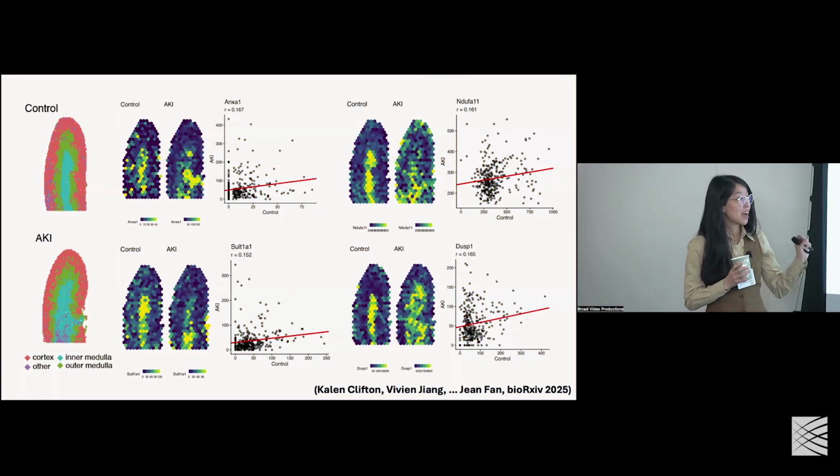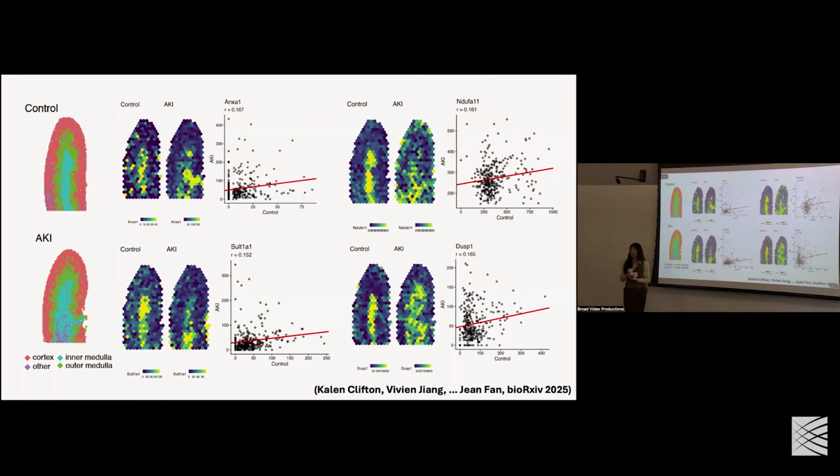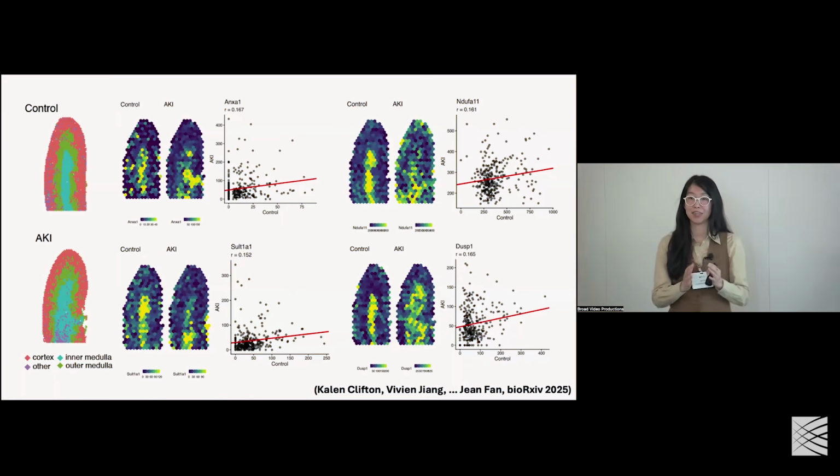Yes, so actually that relates to this rasterization resolution. You can imagine, for example, when we do our alignment, we know the resolution of the alignment, that we're accurate up to 30 microns. So if there's a structure that's thinner than 30 microns, which can definitely be the case with vasculature, then it might be aligned like this. So they're not technically on top of each other, they're next to each other, but our alignment still says that's good enough.